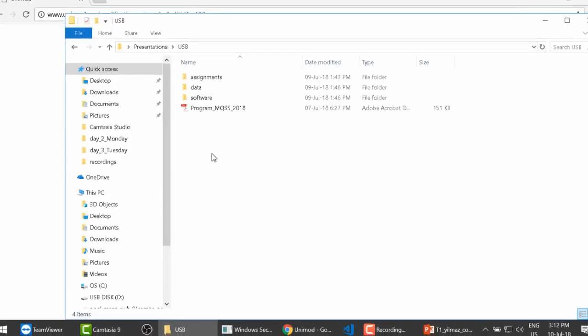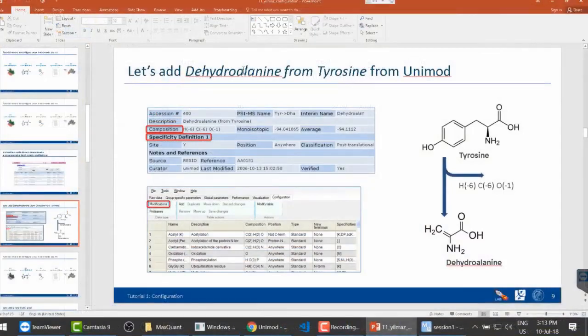Most of you, I hope, already copy and have the software. Sorry? My MaxQuant headers are in German. In German. So it's the system default, it must be. So you should change your system settings. I think your Windows is in German, maybe? No? Huh? Must be, yeah?